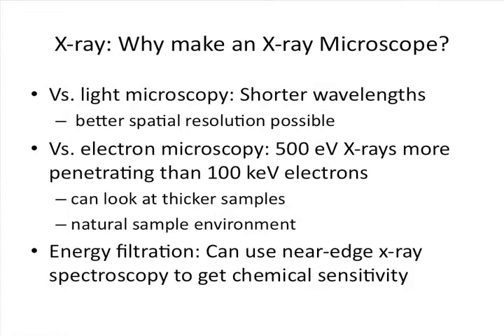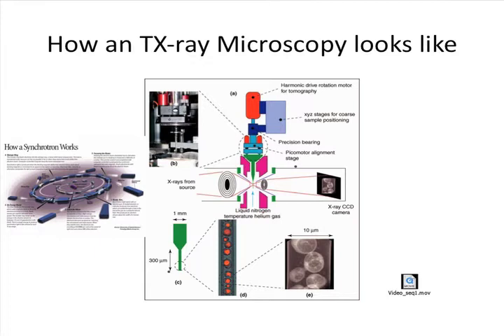So we can get higher resolution, we can go through thicker cells, and we can understand, really at the molecular level through labeling, which are the proteins we are studying. So this is what we proposed. The problem was that we needed a synchrotron, so we went to a synchrotron, ALBA, in Barcelona. We proposed the creation of a whole beam line. We did it. And now, after the summer, the 3rd X-ray microscope in the world will become operational.